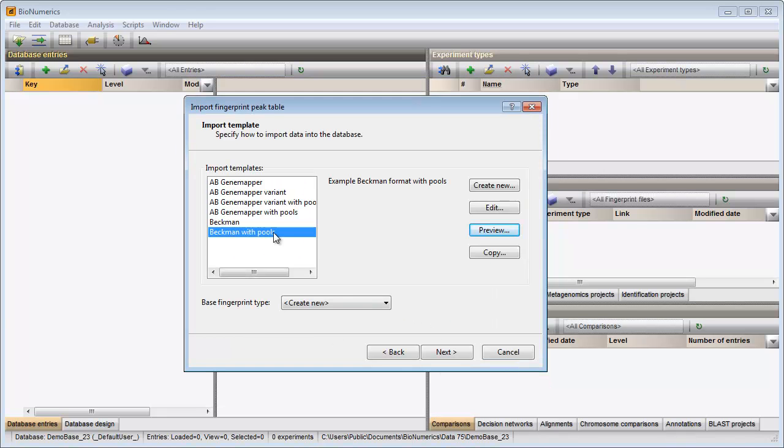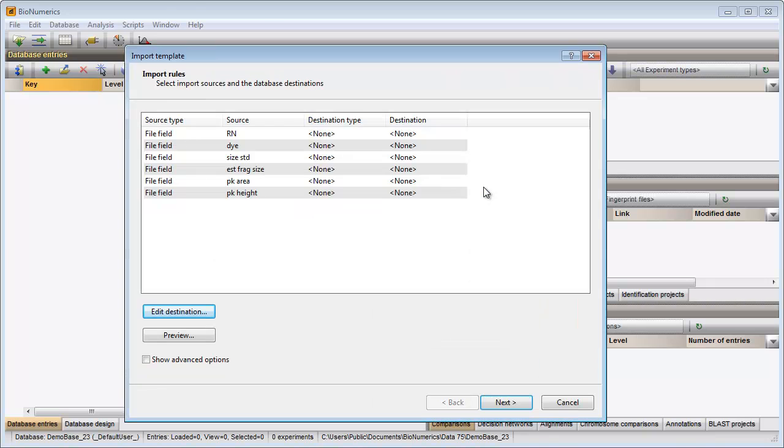I can use this template for the import of my peak file data, but I will demonstrate how to create your own customized template, in case the information in your files does not fit any of the predefined templates. I press the create new button, and in the next dialog, all columns found in the peak file are displayed as rows in the grid.